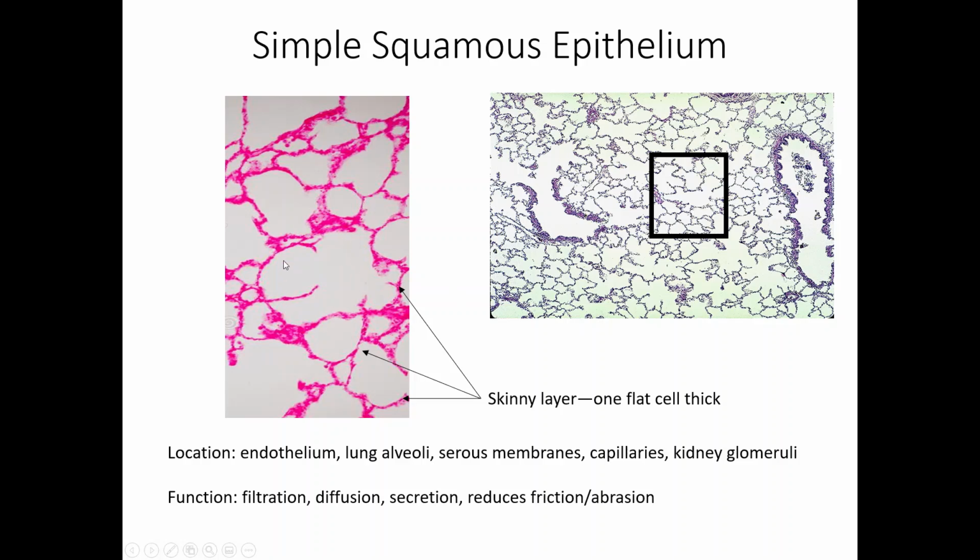You will notice all of this empty space, it really just is empty space. This is, like I said, lung tissue, and this is where all of the air would be coming in from the outside of your body into your lungs, and it would be going through these epithelial tissues, and it would be getting into your blood.